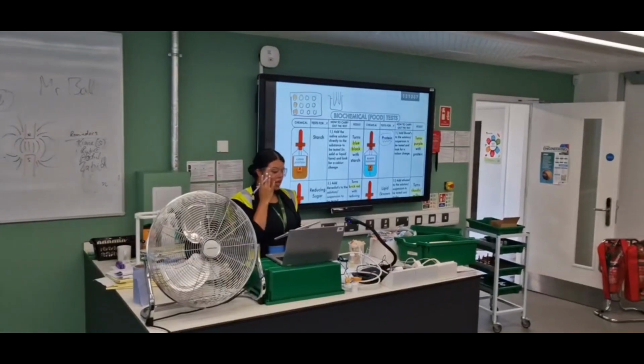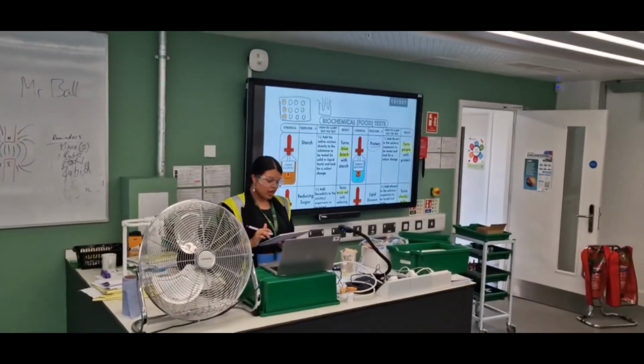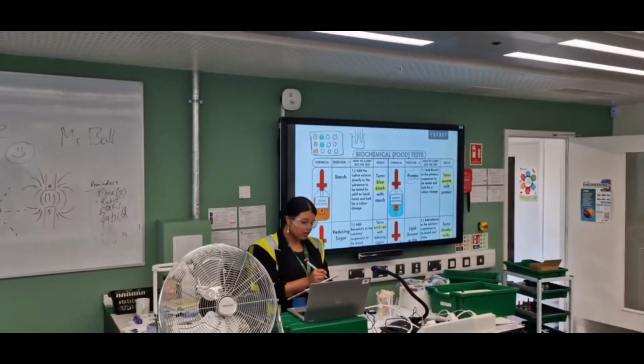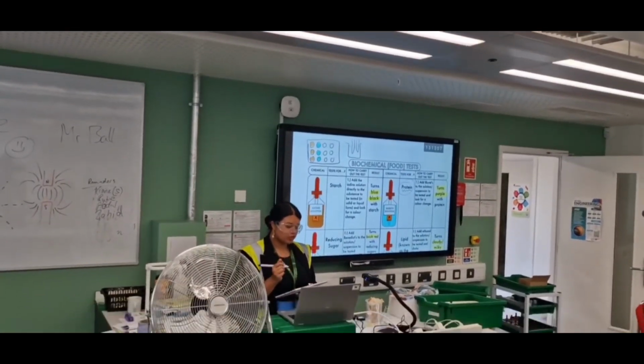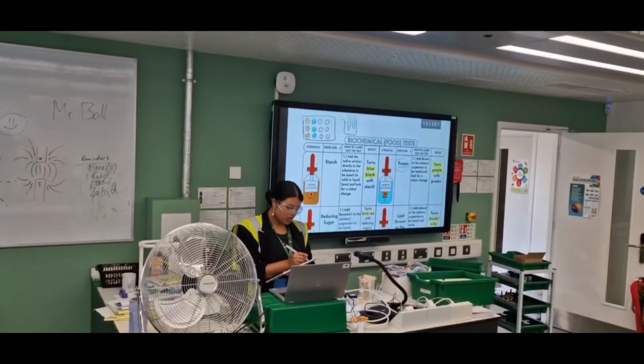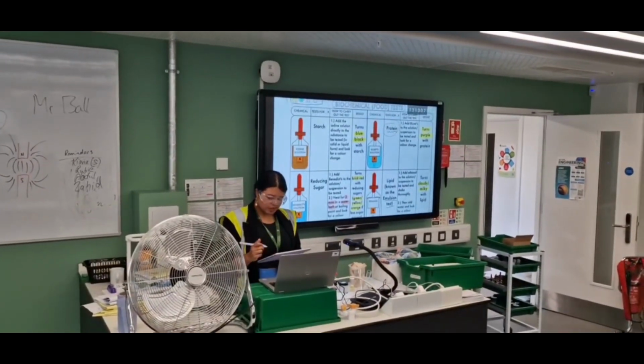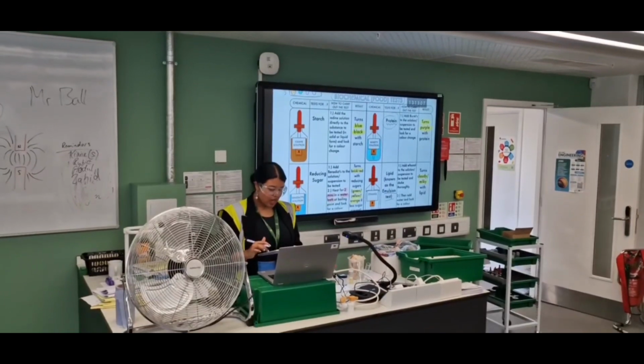So, my iPad is connected to the smartboard. This is the lesson. It is a food test experiment. Students have this lesson printed in front of them in a booklet. My science department, we create booklets which are basically textbooks that follow the curriculum that we have designed.